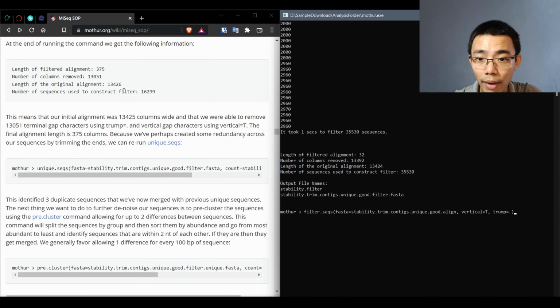However, the problem here is every time you do metagenomic sequencing, there is usually some contamination, for example, from eukaryotes, from mitochondria, from archaea, or just some that are not actually mapped to anything.